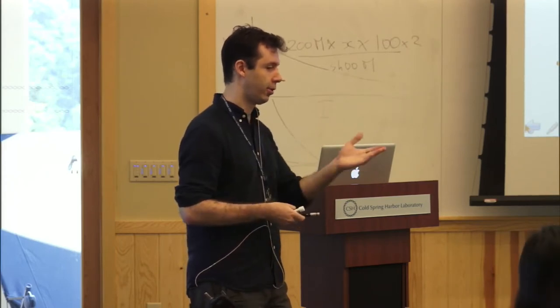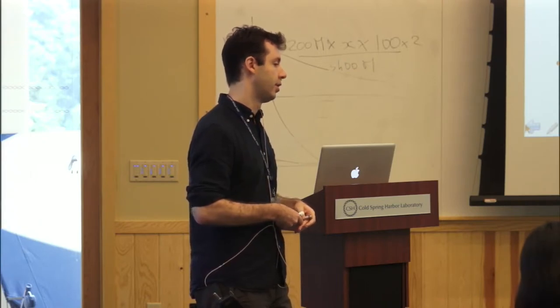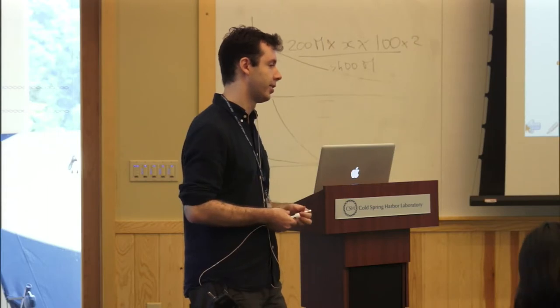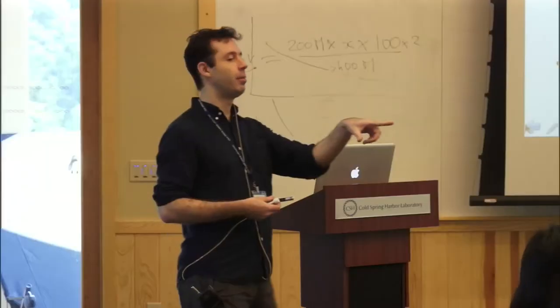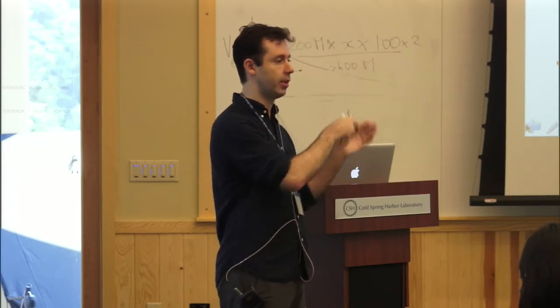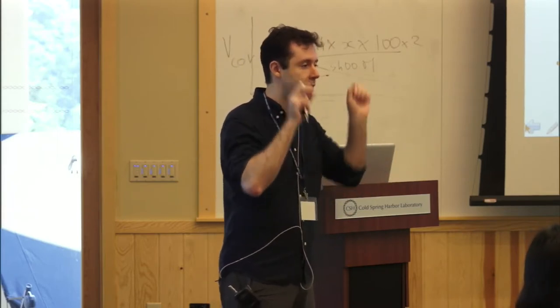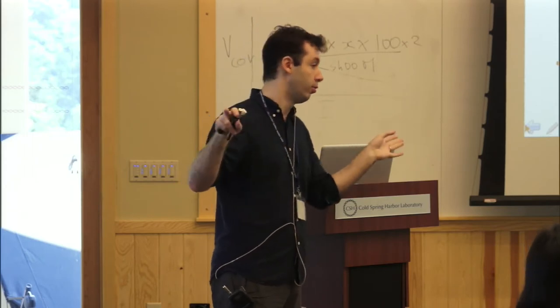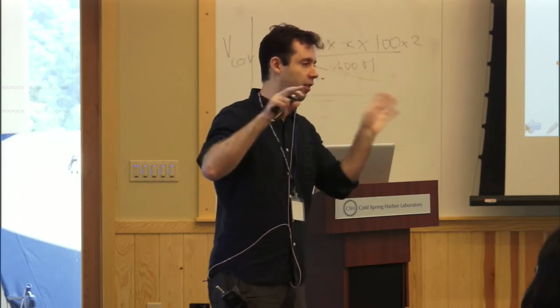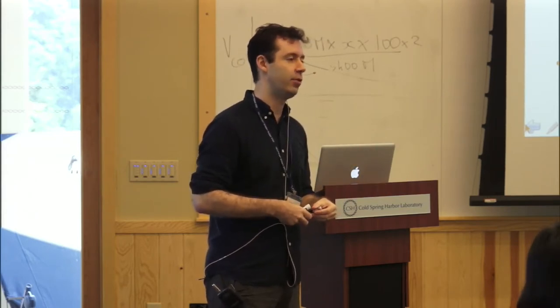What can we do when we get this type of situation? I think there are two ways to handle this. You could divide it. Yeah. Okay. Three ways. It's tricky because you want to be in a situation where you have counts. And counts are very helpful when it comes to statistics on short reads. So if you start splitting the weights of a read across multiple locations, then you lose counts. You don't have counts anymore. You have fractions, and that is not helping you too much in terms of analysis. So you want to stay in a situation where you have counts.